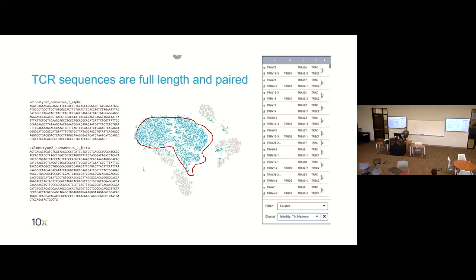They were all amplified from one T cell. You get many copies of this T cell because it has likely been disproportionately amplified due to a requirement to fight some conditions.